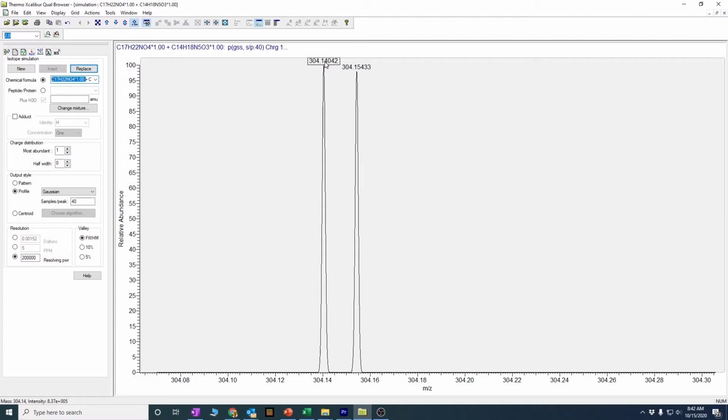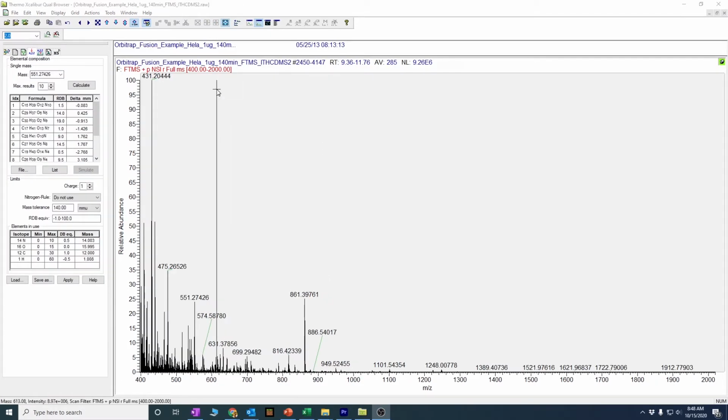And then more to the point, let's look at an example of how once you have a really good exact mass, once you have 4 decimal places reliably, preferably 5, then you can determine the chemical formula from that exact mass. So this is actual data from an Orbitrap. There's a lot of peaks in here, but they're all real. It has such high resolution that it can distinguish these peaks. So you end up with these spectra that you can really zoom in on a lot.